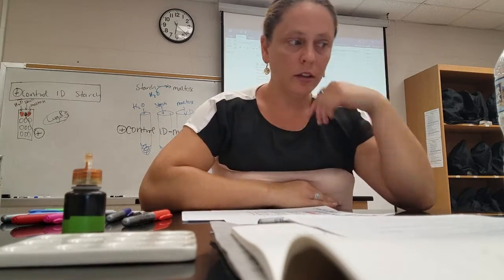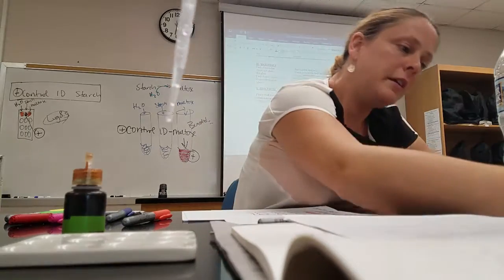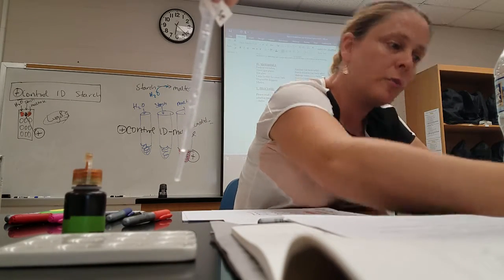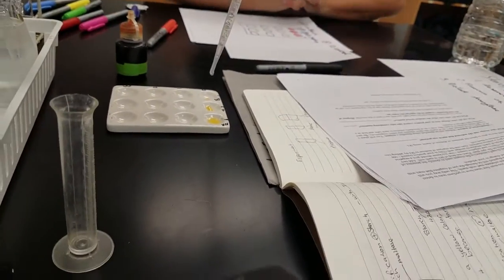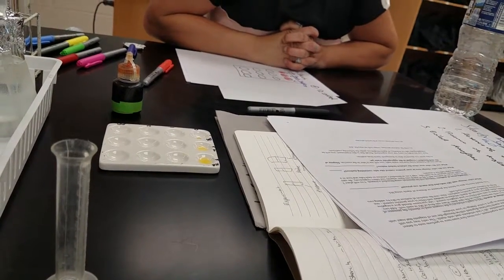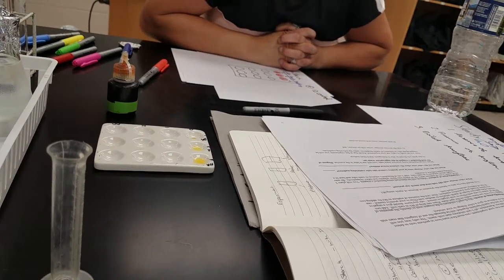Maltose and starch. Maltose? All these solutions are in water, so we need to make sure we're not just detecting water. Is it 2 mL or 2 drops of that? 2 drops, they said. Okay, which is that? Maltose. Now finally a drop of starch.